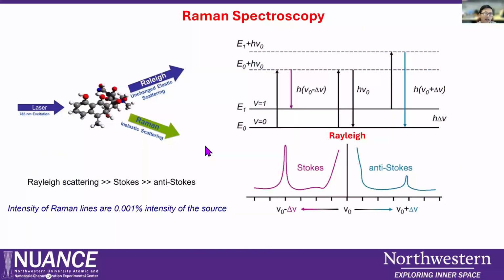So we just talked about IR. We also talk about Raman spectroscopy. Why do we put them together? Because Raman also detects molecular vibration, and some chemical bonds are sensitive to IR, but some are sensitive to Raman. So Raman and IR are both called molecular vibration spectroscopy, and their information is complementary. That's why I put them together.